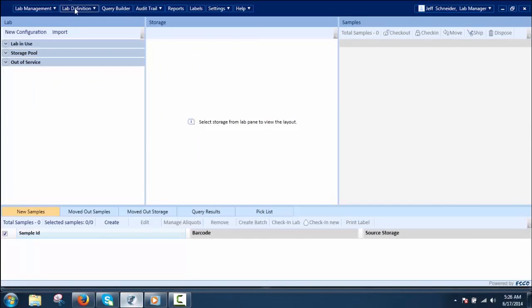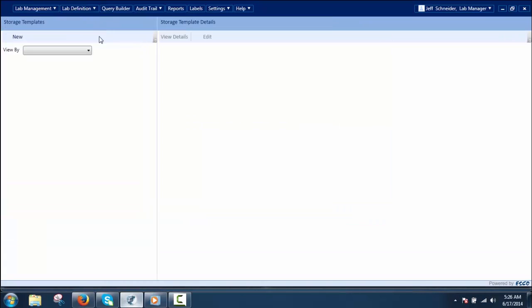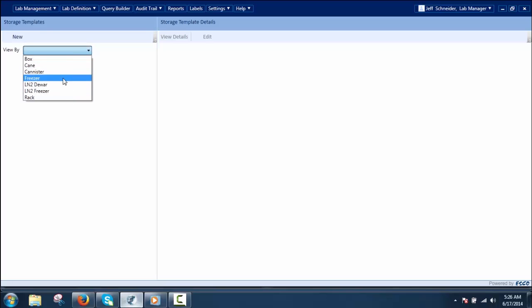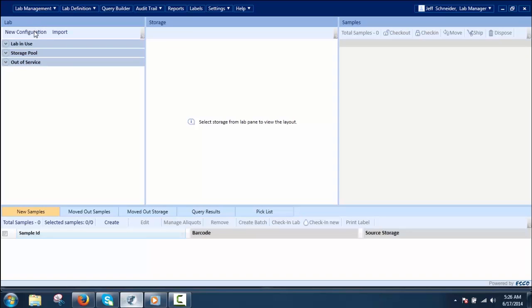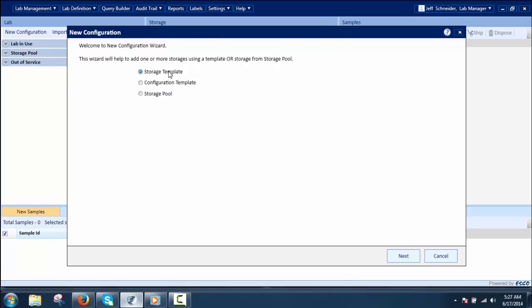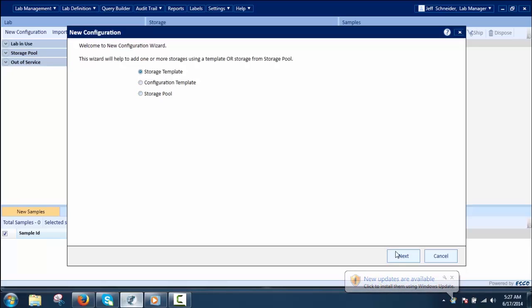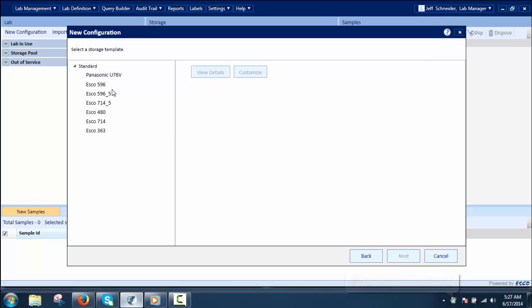New Configuration by Storage Template allows the user to configure new storages using existing storage templates. Existing storage templates are the ready base for users to add new storages having the same template type. Clicking New Configuration will display a new configuration wizard that allows you to add one or more storages using a storage template. The prerequisite is that the storage template must be defined for the respective storages before selecting the storage template option.